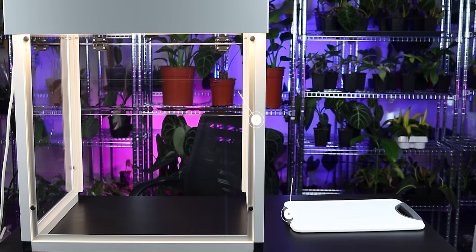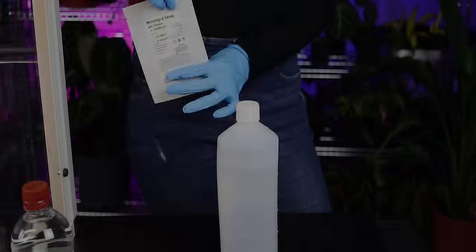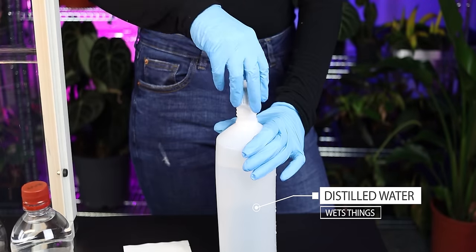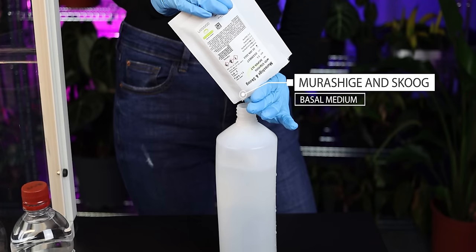As I mentioned before, in this demonstration, I'm using a laminar flow hood. These are used in laboratories to produce a clean flow of air that passes over the medium inside and keeps it free from any airborne contaminants such as spores and bacteria. The first thing we need to do is prepare the growth medium. For this, I'm using MS, which is essentially a mixture containing all of the essential growing chemicals for these plants.